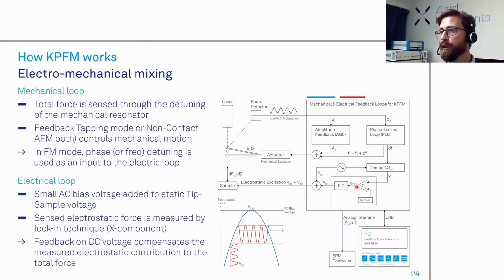And now you want to regulate this basically to 0, because when you have strong force you have a large X, and at the CPD you have a contribution at 0. So basically everything happens between this probing voltage, AC here, and this DC compensation voltage here. And that's basically the root of Kelvin probe.